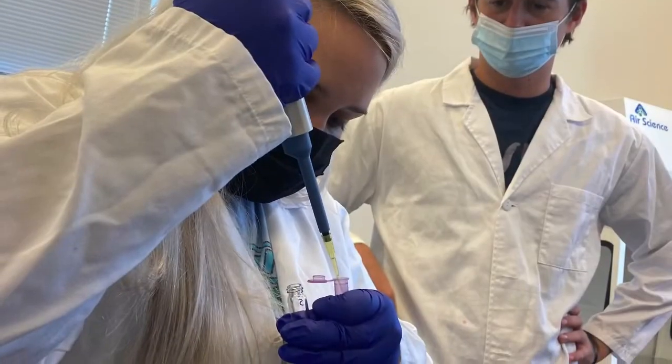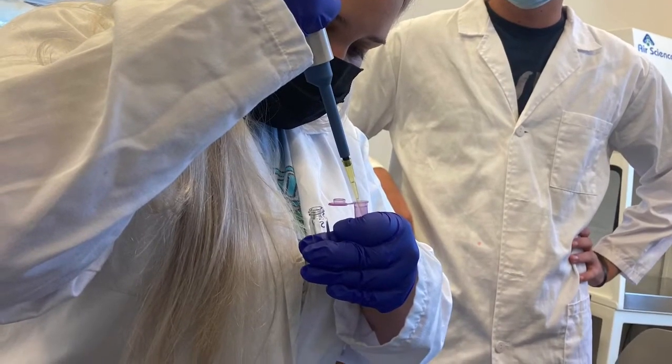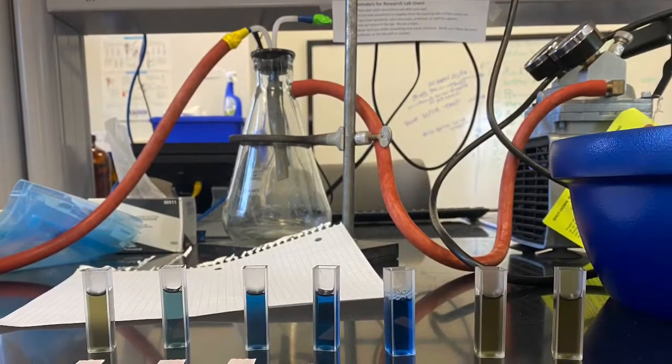We created our protein standards for this analysis using bovine serum albumin, BSA, as it is a universally accepted reference point for total protein quantitation.